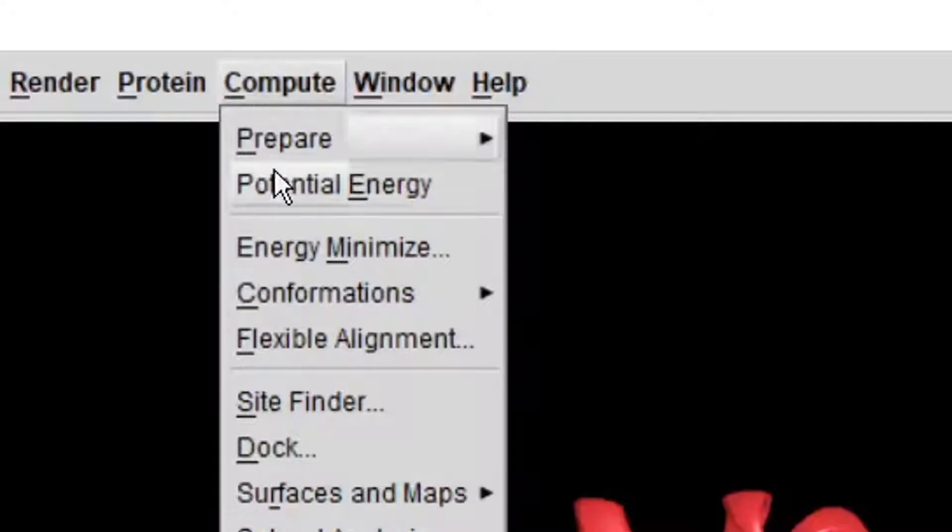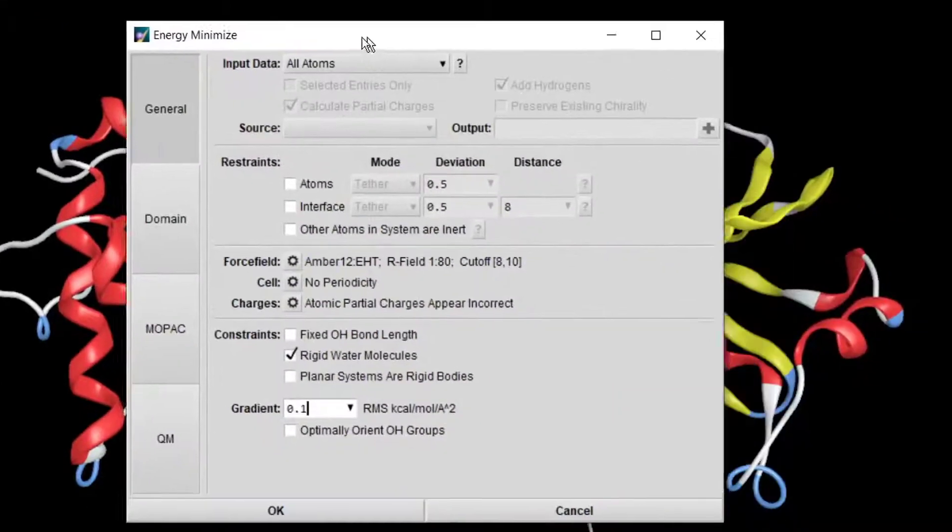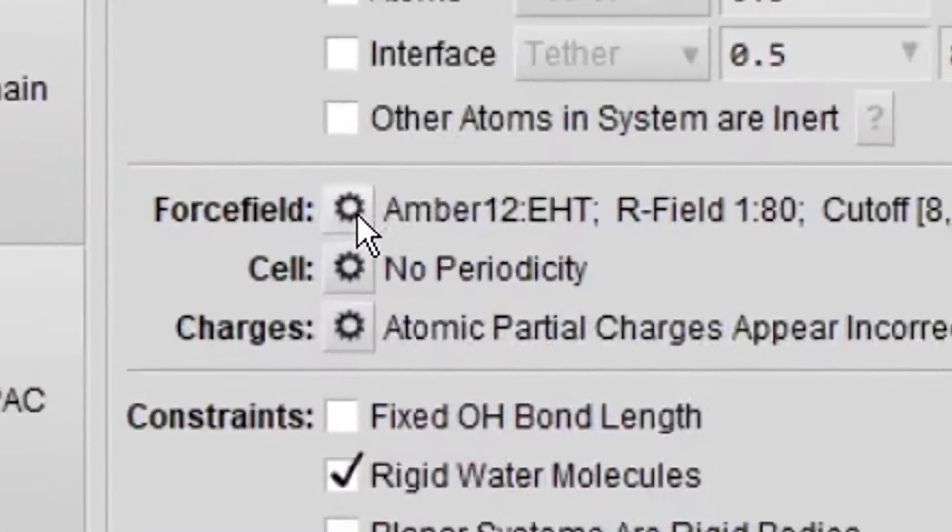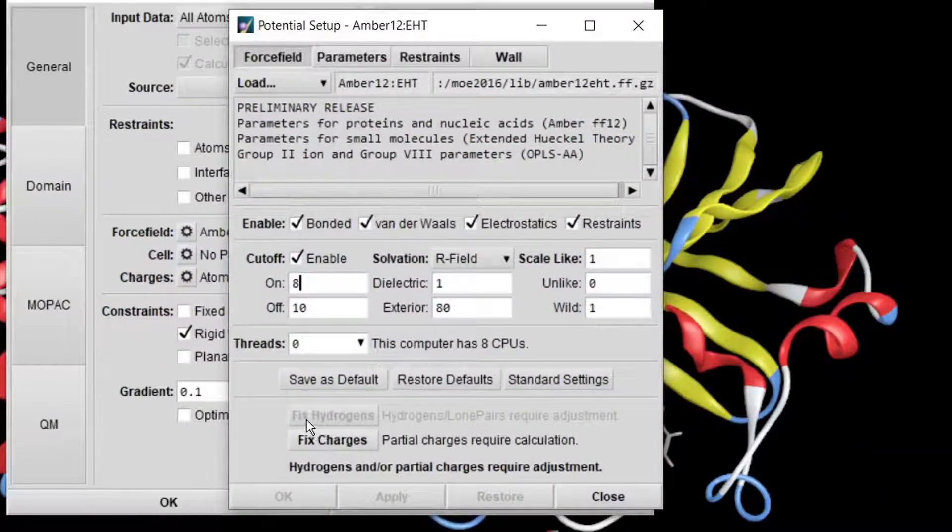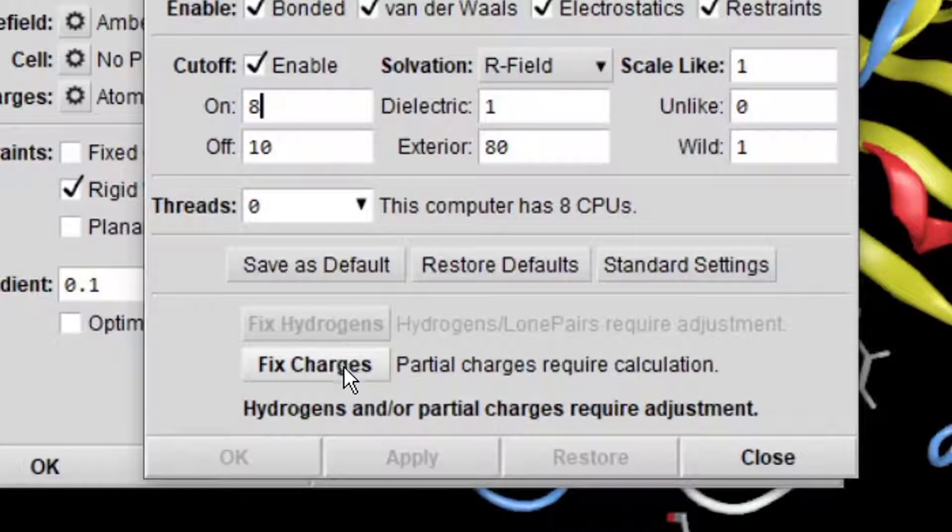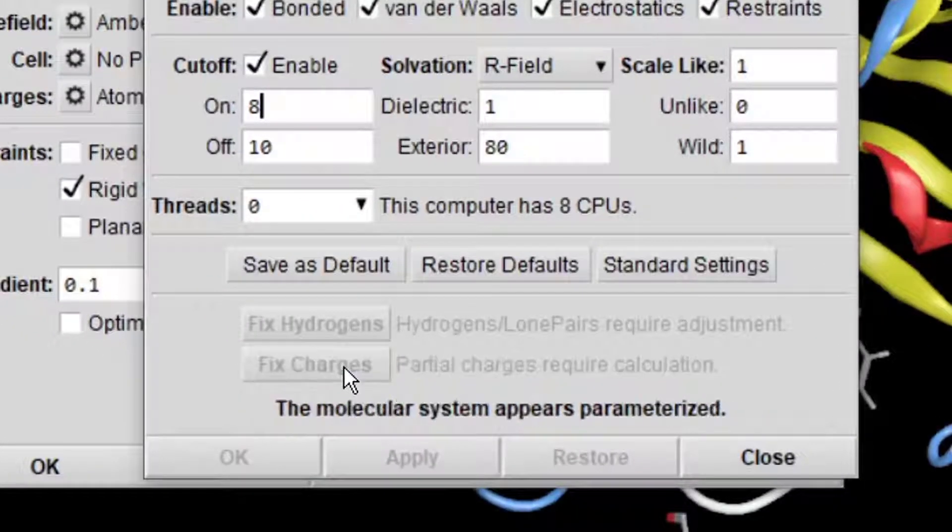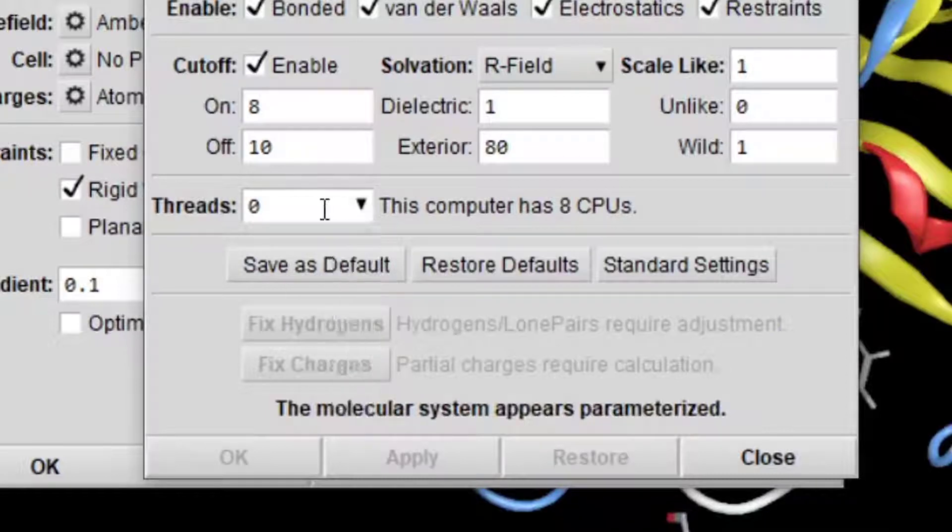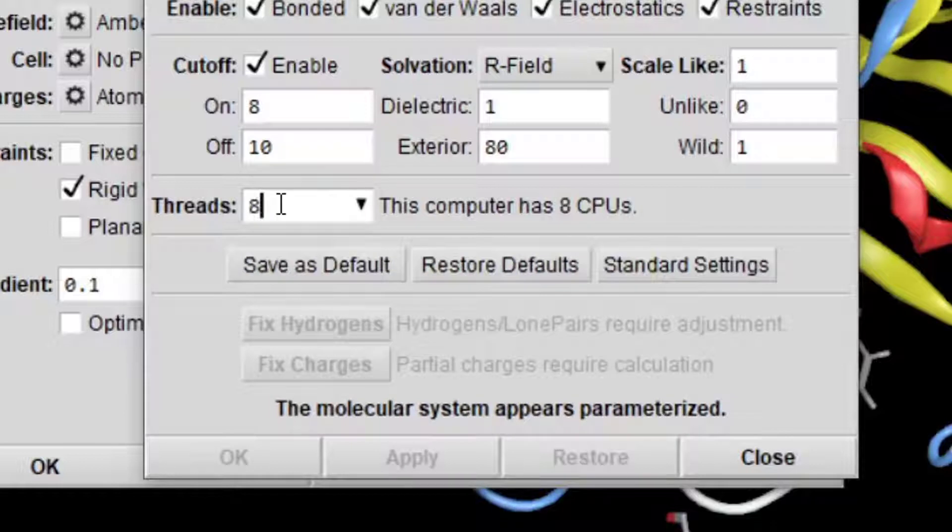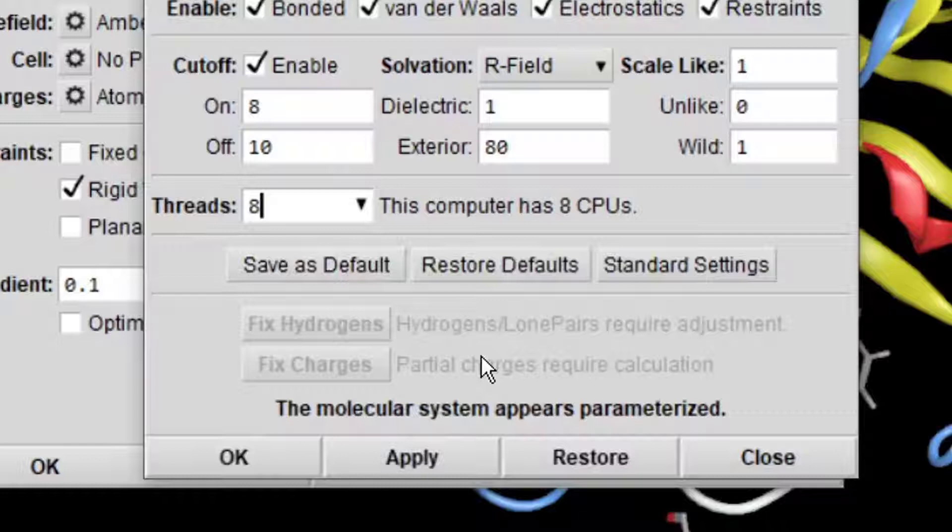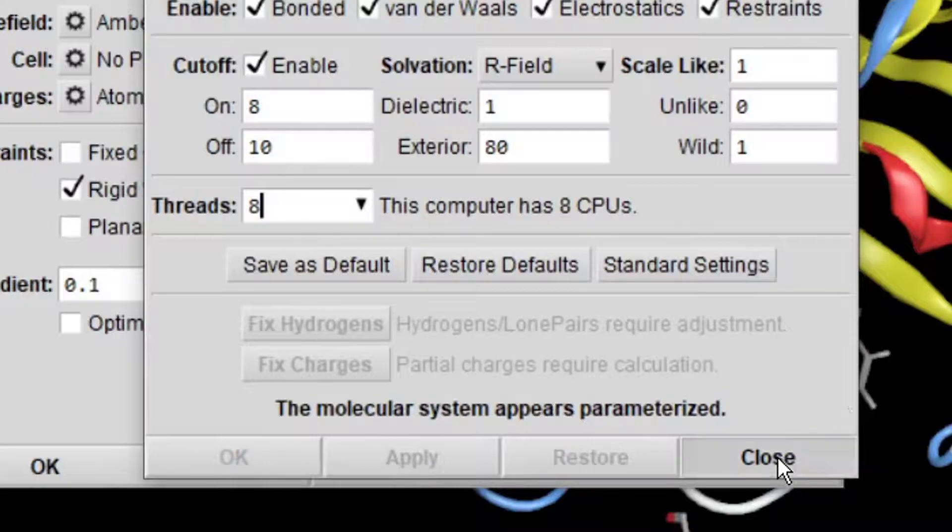Go to compute and click on energy minimize. Go to force field. The hydrogens are already fixed. Click on fit charges. You can change... My laptop has eight CPUs, so I will change this to 8 to speed up the process. This energy minimization will use eight CPUs of my laptop. Click apply and then close.